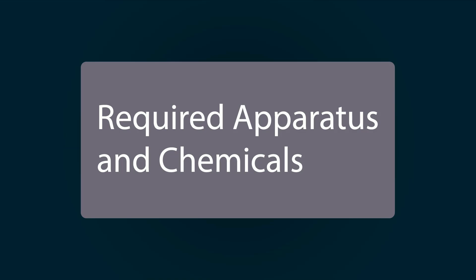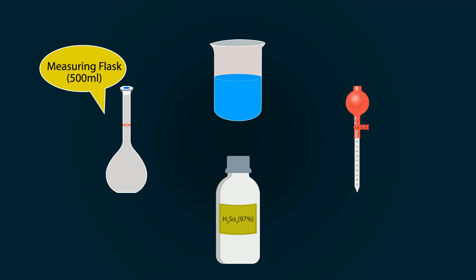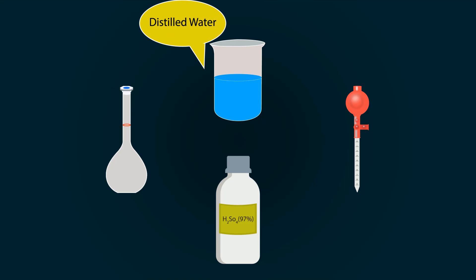The required equipment and chemicals are: a 500 milliliter measuring flask, distilled water in a beaker, a pipette, and H2SO4 which is sulfuric acid.